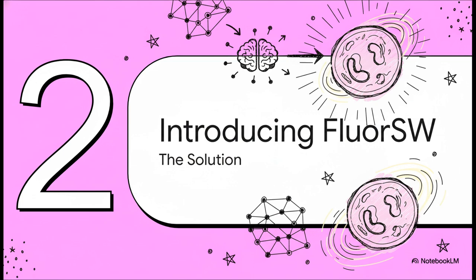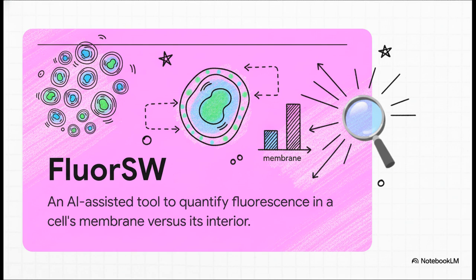So, to finally answer that question, a team of researchers built a really ingenious new tool. Let me introduce you to the hero of our story, a tool called FluorSW. So what is FluorSW? Well, think of it as this super smart open source software that was built to do one thing and one thing really well. Analyze those crowded images, perfectly outline each individual cell, and then precisely measure the fluorescent signals, those are the glowing tags that let us track proteins, in two separate zones, the membrane and the interior.